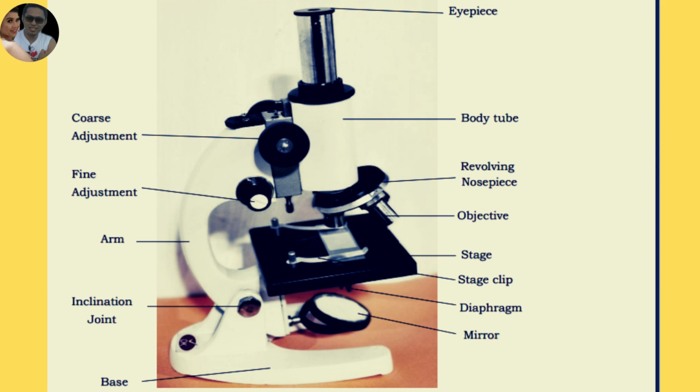In the picture is the compound light microscope. It comes with two sets of lenses which causes it to achieve a higher level of magnification. It uses diffuse light from the sun or artificial light to illuminate the object to be observed through the glass lenses. The parts of the compound microscope and its corresponding functions are as follows.